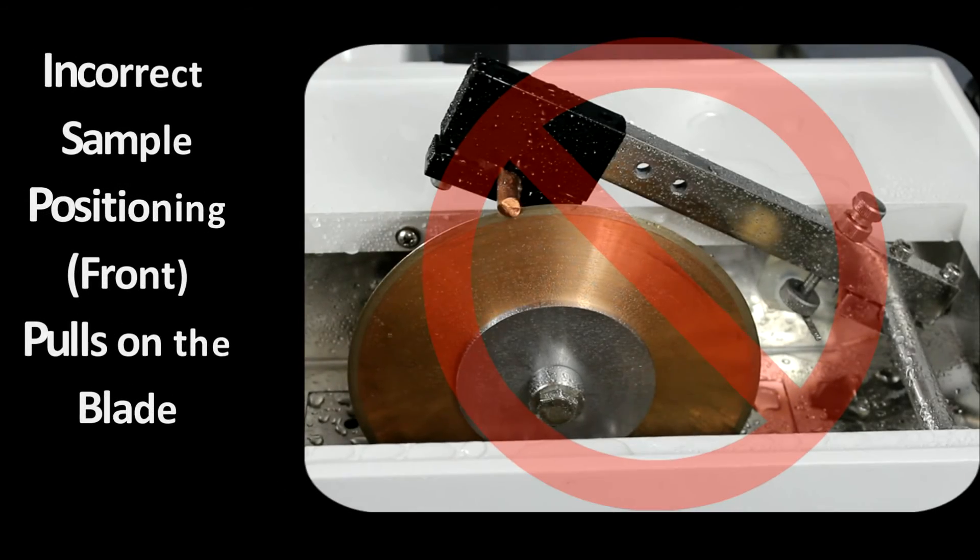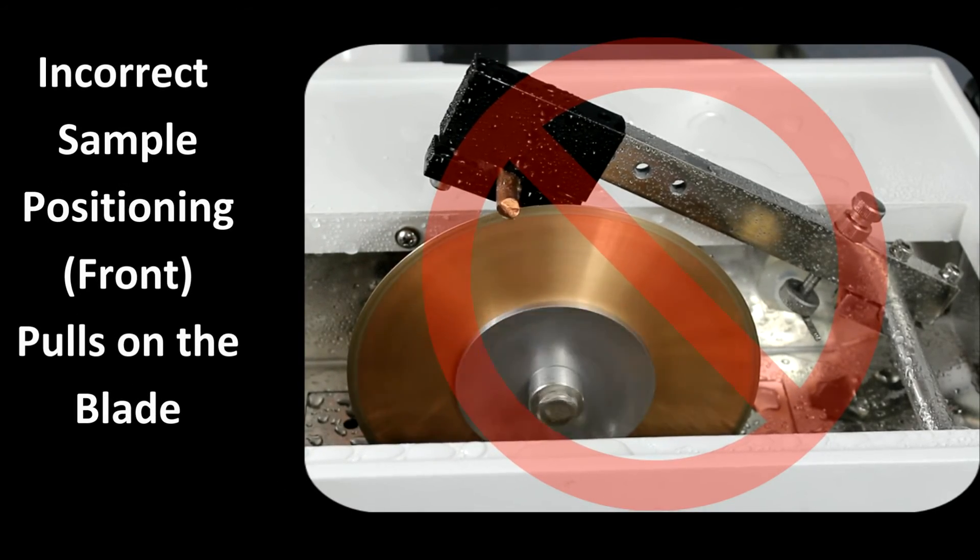For soft, gummy material such as copper, if the sample is located on the front side of the blade apex, it produces a lot of drag on the motor, as the cutting operation is pulling the specimen down into the blade. This can possibly stall the blade.